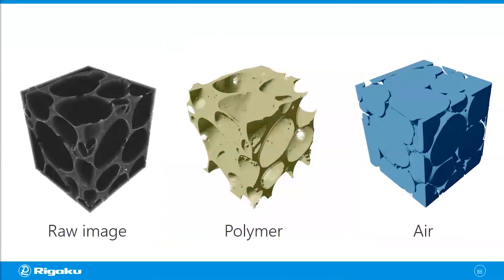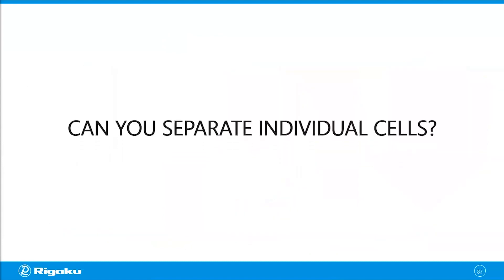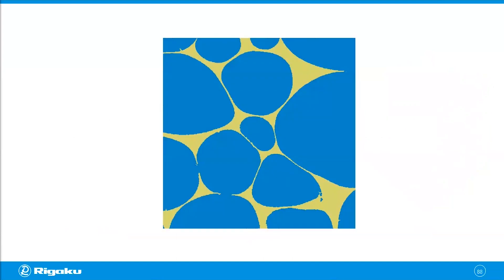Now you might wonder: can you separate those individual cells? Yes, and there are many ways to do this. When objects are not too strongly connected, you can apply an open operation to separate them. But in this particular case, some cells are pretty well connected with multiple voxels connecting them. When this happens, a simple open operation won't work. Let's look at an example using Avizo from Thermo Fisher, because the way this program handles object separation is less of a black box — you can see how the program does it.